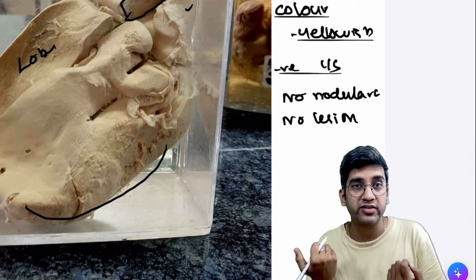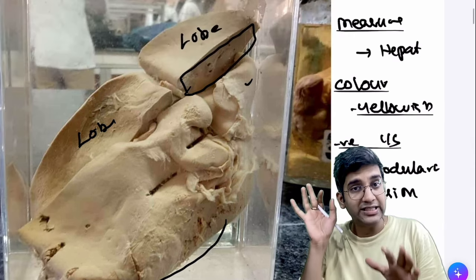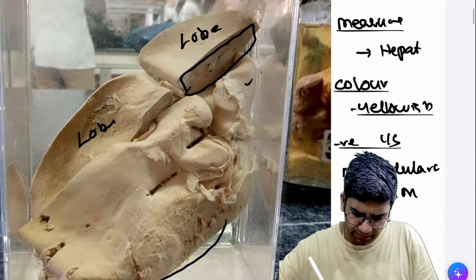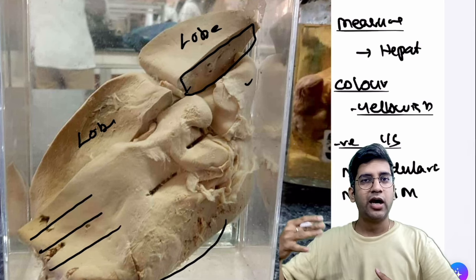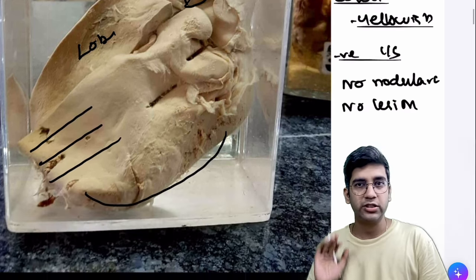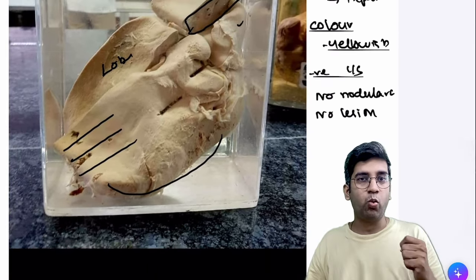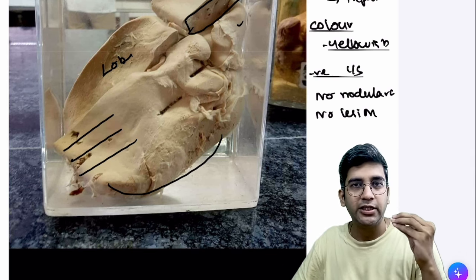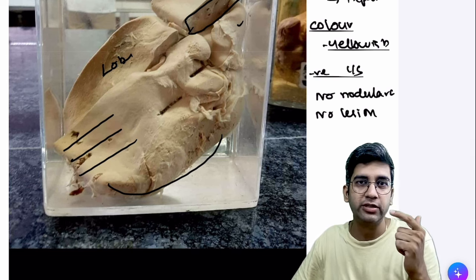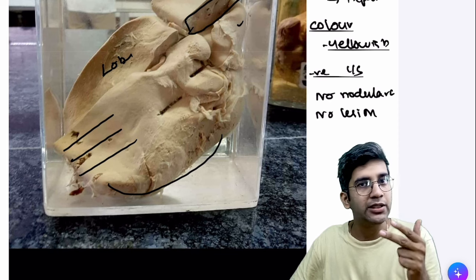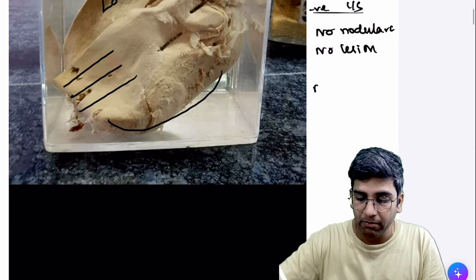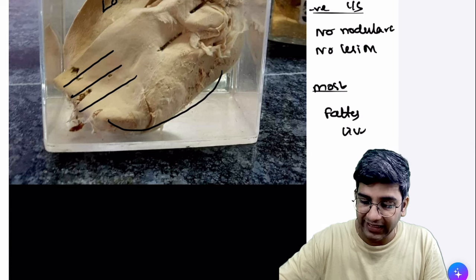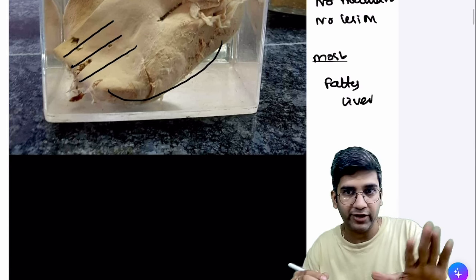There is a possibility of cirrhosis coexisting, so noting its absence is important. Whatever cut surface I can see here looks normal, but I would add that multiple serial cut sections would be needed to fully assess the architecture of the rest of the liver, which is not visible here. So to summarize for the examiner: this is a liver specimen that is grossly enlarged, yellow in color, with no lesions on the cut surface — most probable diagnosis is fatty liver.